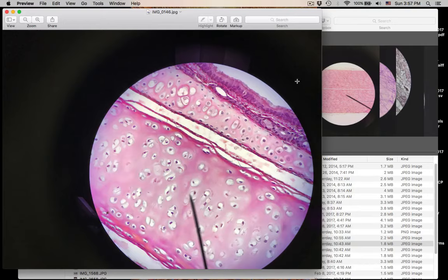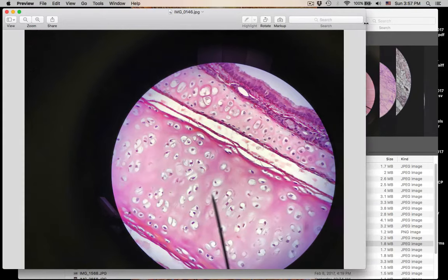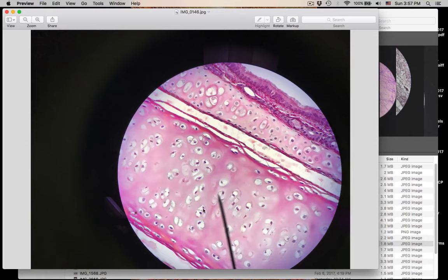What type of connective tissue is this, where the pointer is? What's the name of this connective tissue? That is number fourteen.